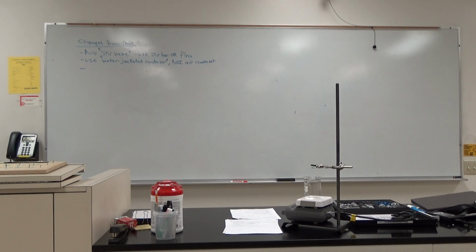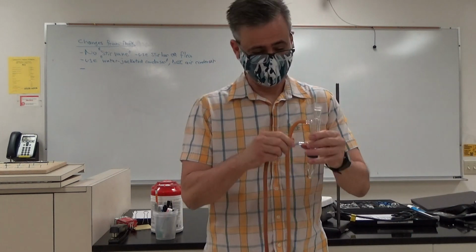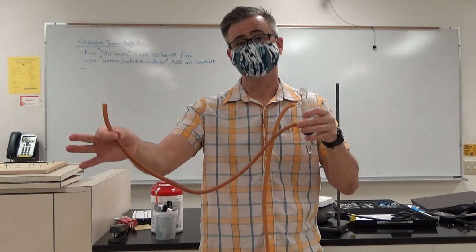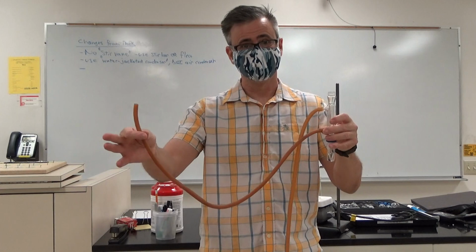Well, if I was working here, it goes... write this down. All right, I'll show you guys and I'll show the camera. It goes in the bottom, out the top, and down into the drain. Okay. I'm back. In the bottom, okay, and then this connects to my sink, all right?